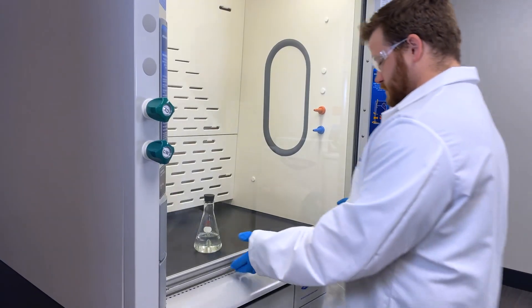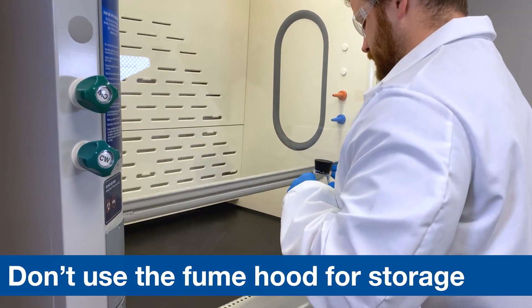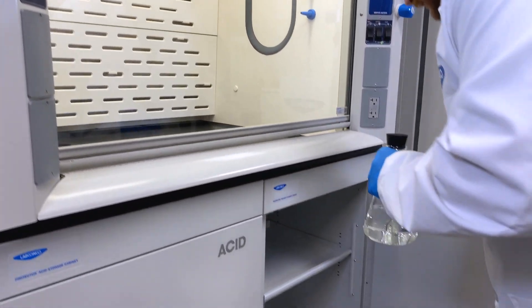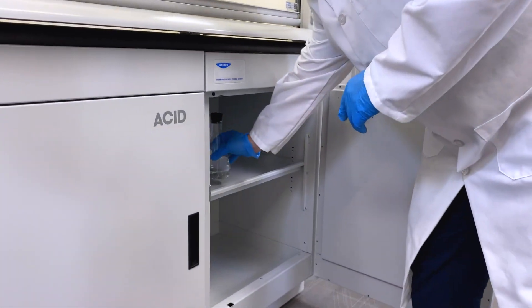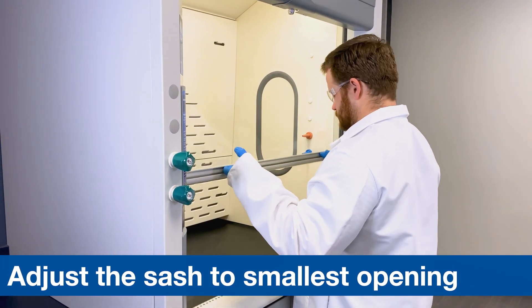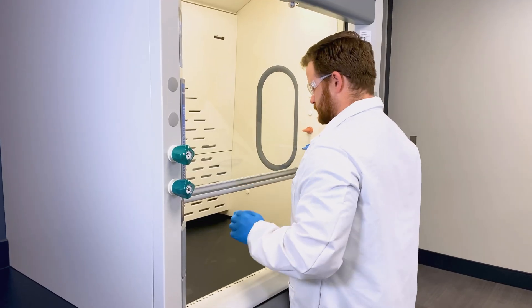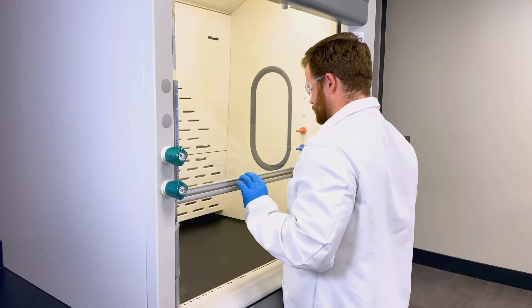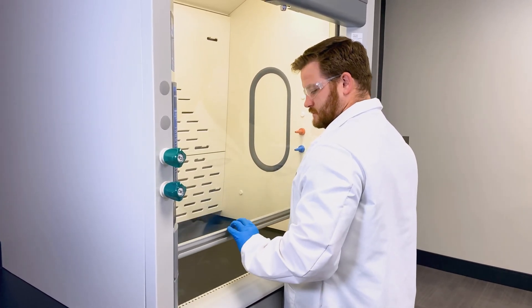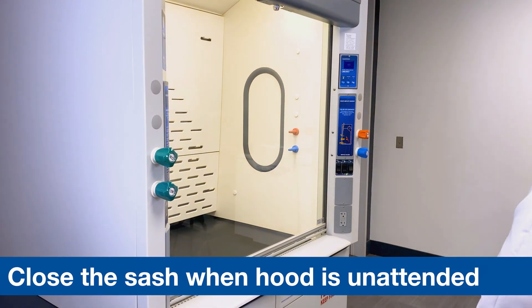Do not use the hood for storage. Chemicals should be capped and stored in the appropriate chemical storage cabinet when not in use. Adjust the sash to the smallest opening possible when in use. Locate the sash at a comfortable height just above the elbows and look into the hood through the glass. Close the sash when the hood is unattended.